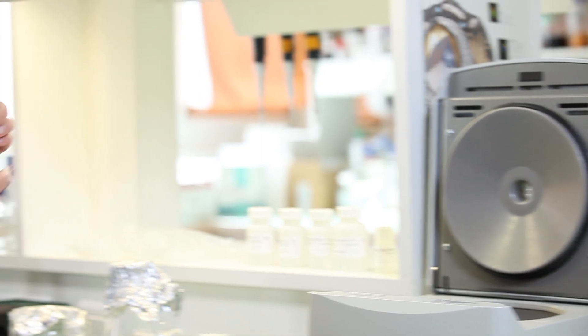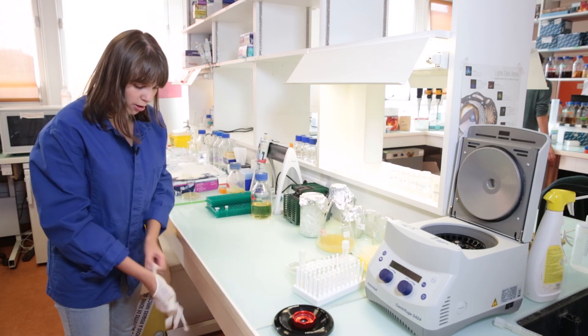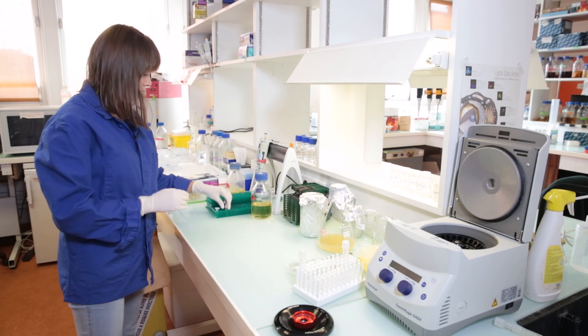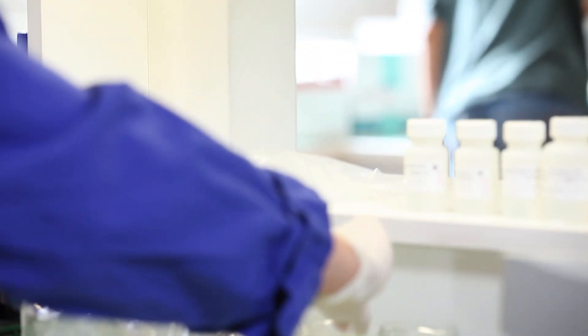So our pellets are ready. They are here at the bottom of the tube and we are now ready to continue with the mini prep. For all the next steps I will put gloves on to protect the DNA-containing sample from any DNA that could be on my hands. Now we have to discard the supernatant by just pouring it out, and we only keep the pellet on the bottom.